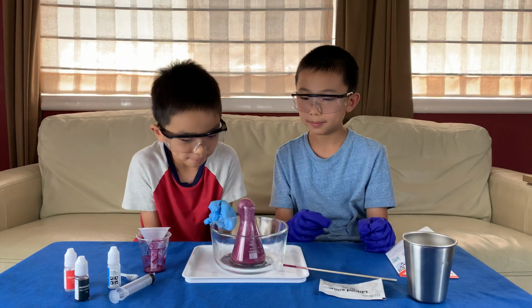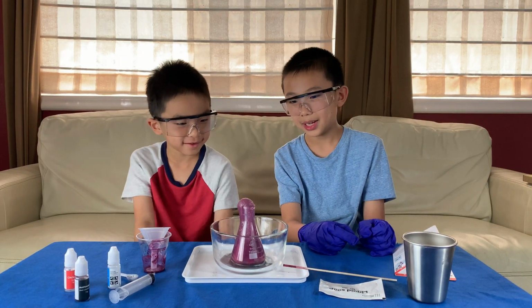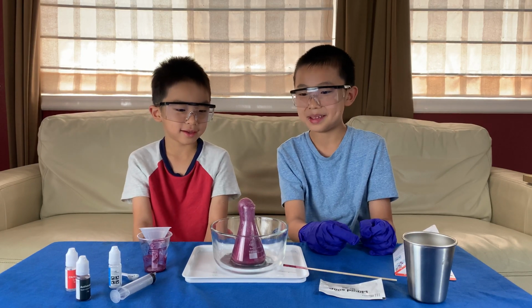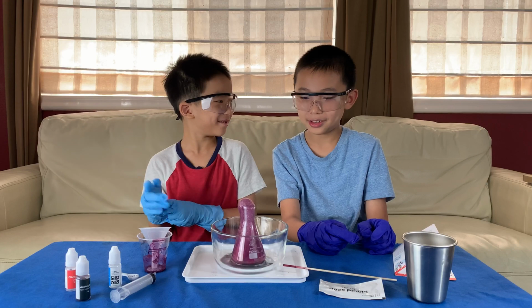Oh, there's all the blue and purple. Yeah, it does look really cool. And it almost looks like it tastes yummy, but you don't drink it. And don't touch the top. And don't put it in your eyes.